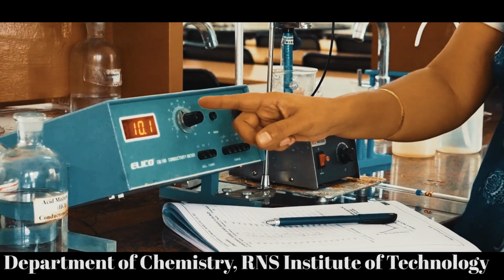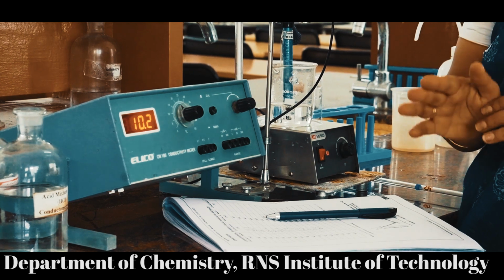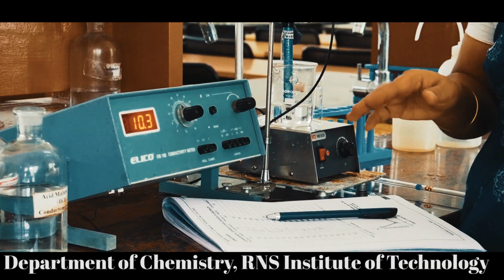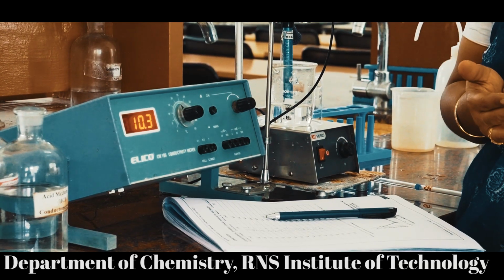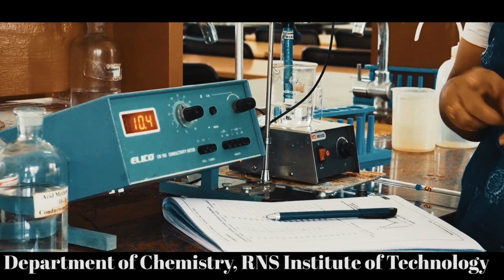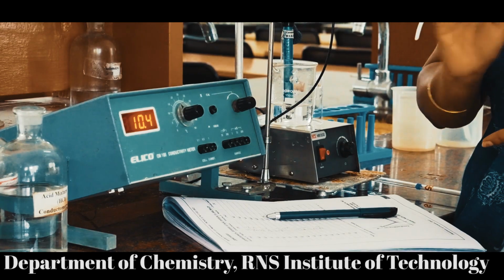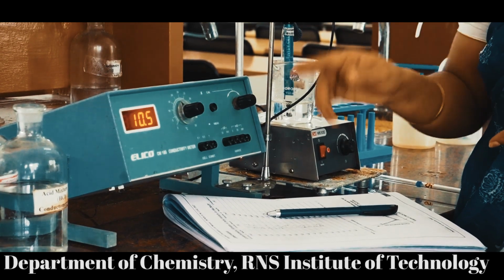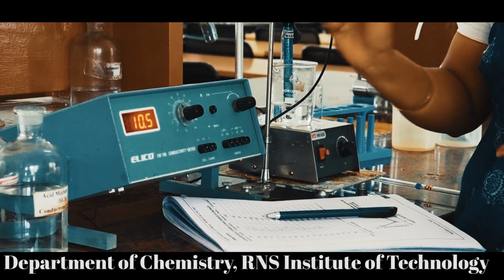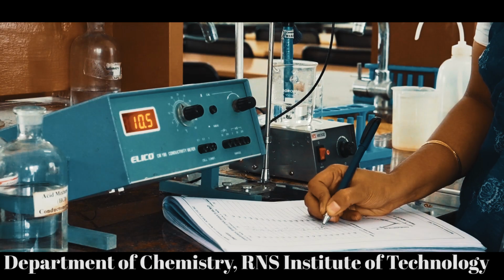Now there is an increase in the conductance. This tells us that the neutralization of HCl is completed. Now the neutralization of acetic acid takes place, so there will be formation of sodium acetate. Since it is a good electrolyte, there will be a slight increase, not too sharp. See, from 10 it is 10.5. This increase in conductance is because of sodium acetate, a good electrolyte.